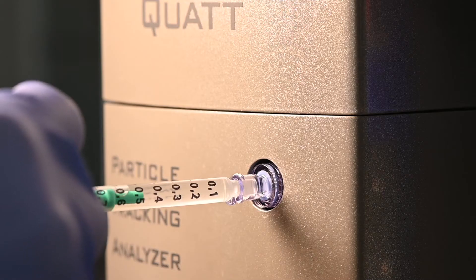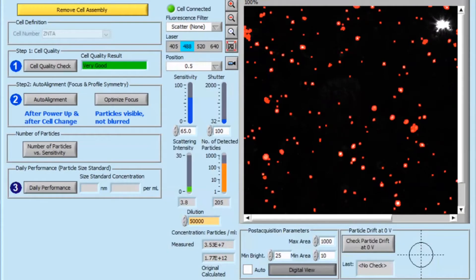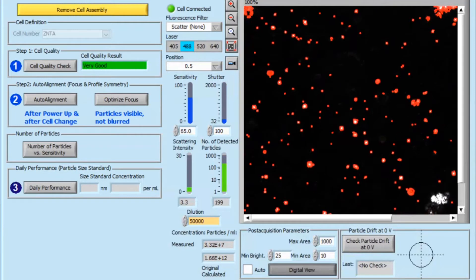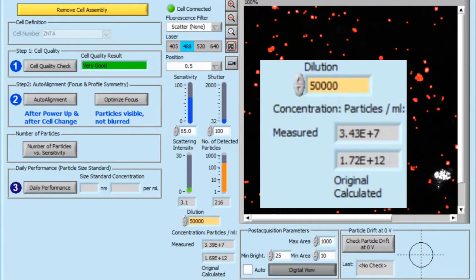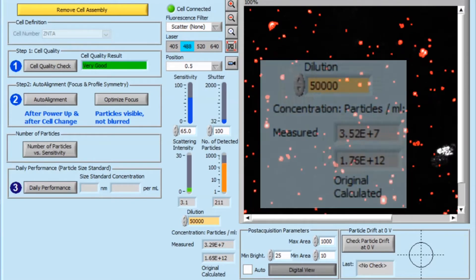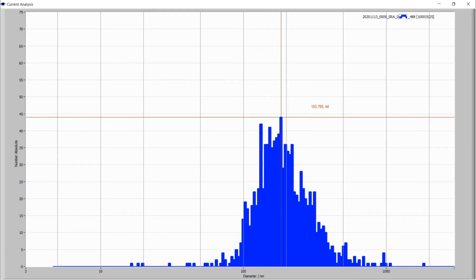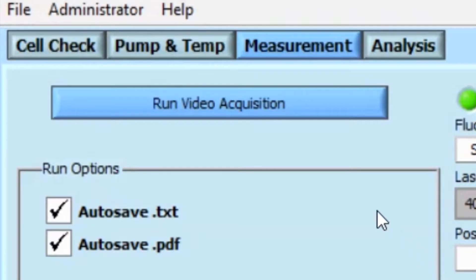After injection of your sample into the measurement chamber, you can instantaneously see your particles in the ZetaVue software. The concentration is measured steadily. By following the Brownian motion of the particles, the size of each individual particle can be analyzed, and a measurement can be started by a click in the software.